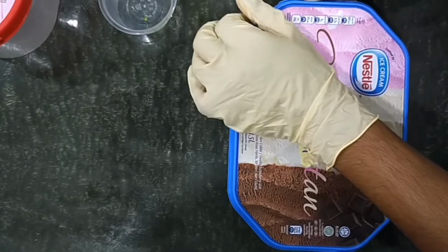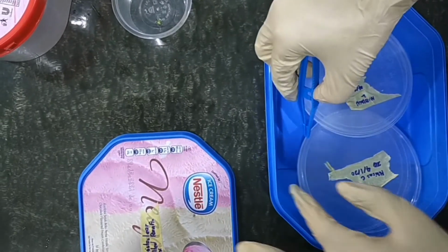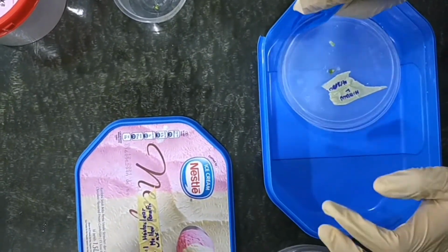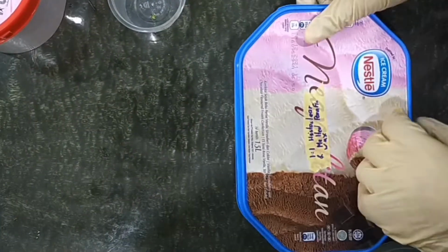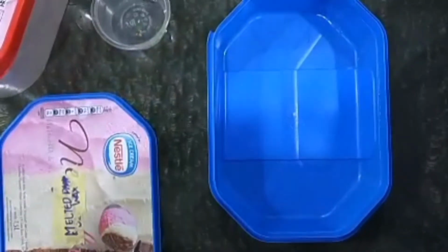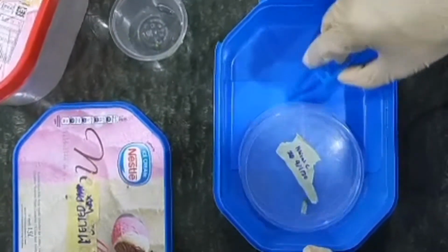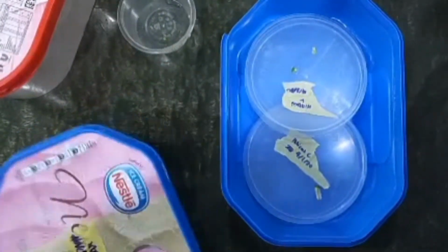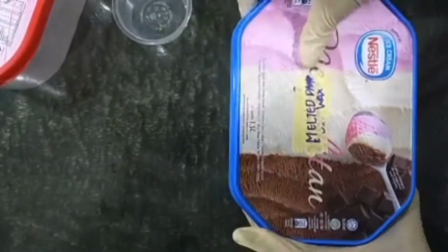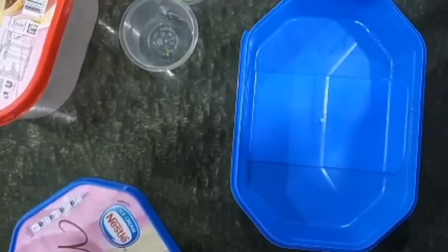Then, the cassette is removed from the 1:1 ratio of Histoclear and melted paraffin wax. Please take it out using a forceps and with caution. After that, the specimen is transferred into a new tank which only contains melted paraffin wax, and incubated at 60 degrees Celsius for 3 days. Remove the specimens using the forceps with caution. So now we are ready for the embedding process.